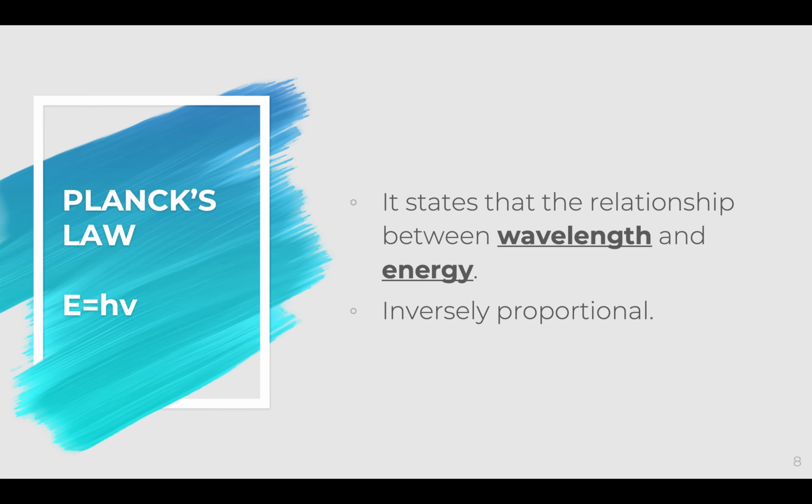So, according to Planck's law, the relationship between wavelength and energy is inversely proportional. Okay? Inversely proportional. As you can see on your left, that is the formula for Planck's law. Energy, signified by E, is equal to Planck's constant, which is h, times your frequency. So, sir, why do we need to talk about wavelength and frequency?